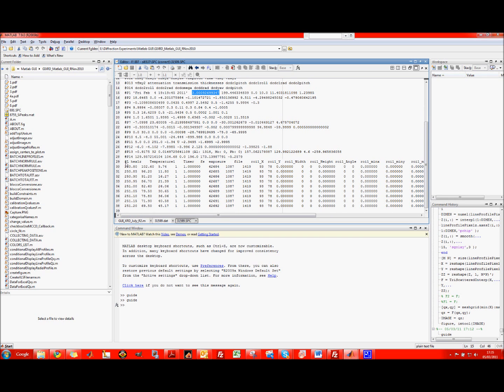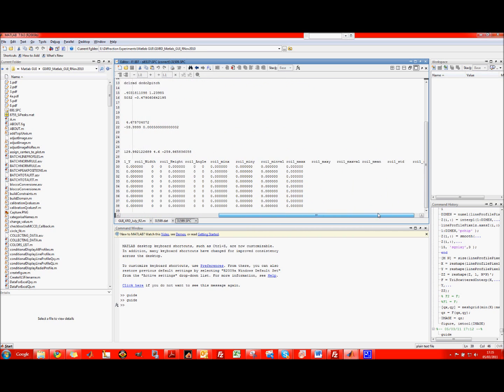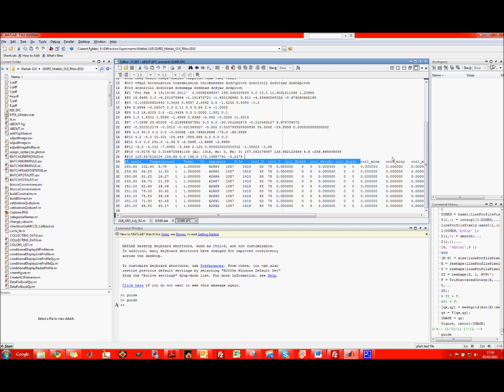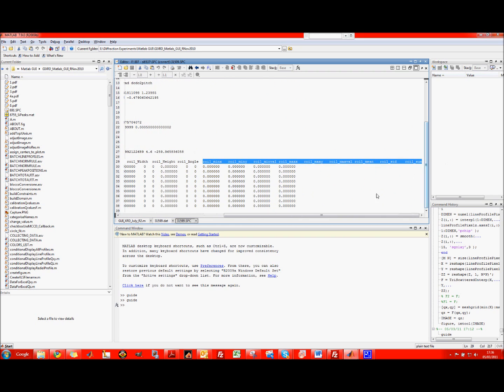And then you have the various columns corresponding to the current scan that you are doing. And another important thing, we have a reference to the TIFF file, and then all the regions of interest defined during the experiment.